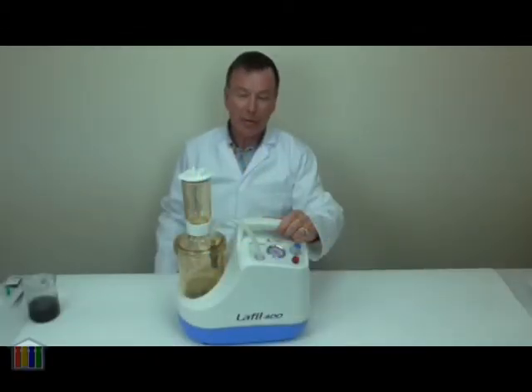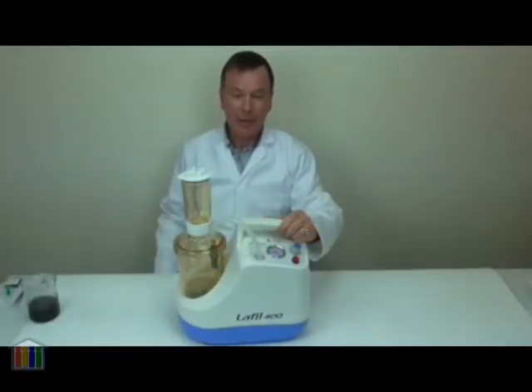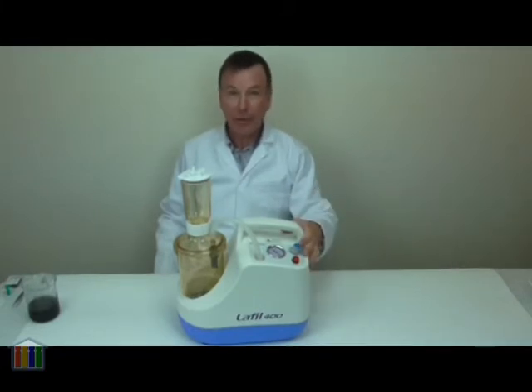Hello, my name is Mark and welcome to LabHut training videos. Today we're going to talk about the LAFIL 400 Laboratory Filtration System.